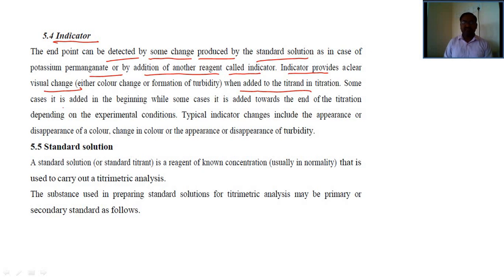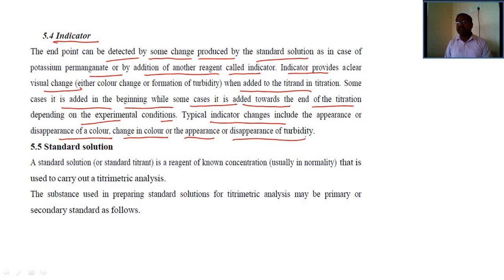In some cases it is added in the beginning, while in some cases it is added towards the end of the titration. It depends upon the experimental conditions. The typical indicator changes include the appearance or disappearance of color, change in color, or the appearance or disappearance of turbidity.